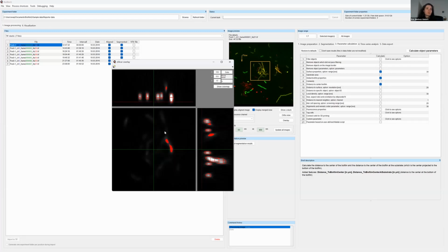If your segmentation is not good, the chances of getting artifacts are high. But that is also one of the good things about using cubes, that you don't really care about a single cell segmentation. You just care about, is there biomass or is there no biomass? And then can I calculate features for the biomass that there is? Detecting biomass is much easier than actually doing a single cell segmentation.